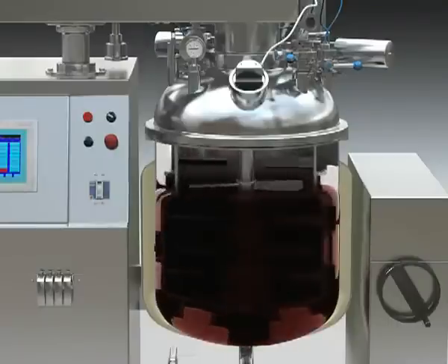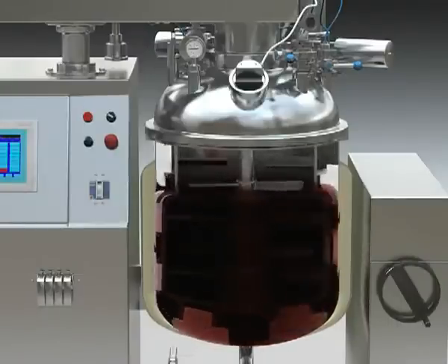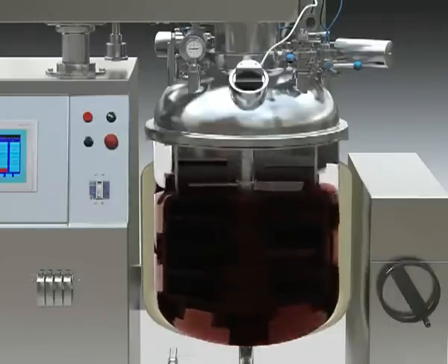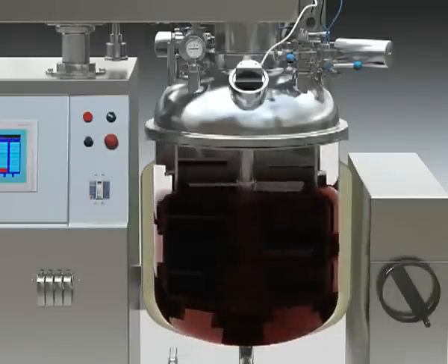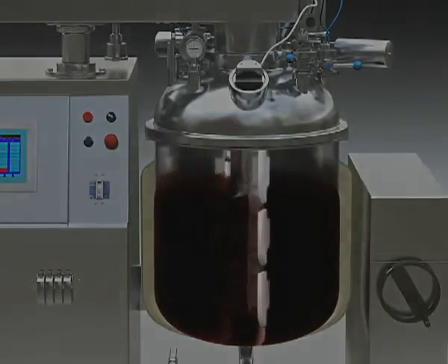Materials are loaded into the emulsifier from up and bottom of the tank, and will be thrown out in the middle by centrifugal force. At the same time, the materials will be cut into very small granules under the effect of the emulsifier head and emulsifier cover.